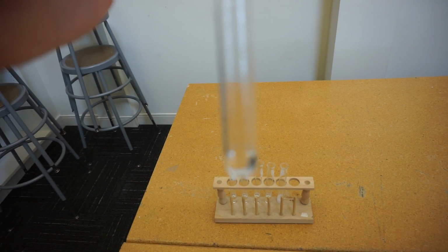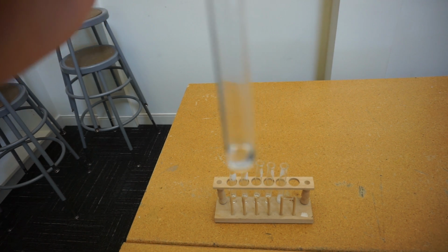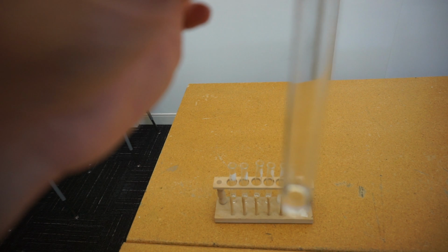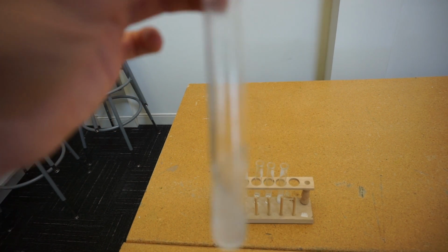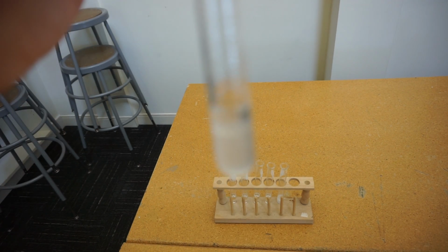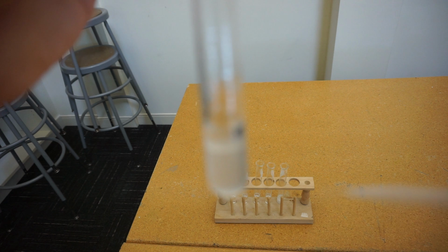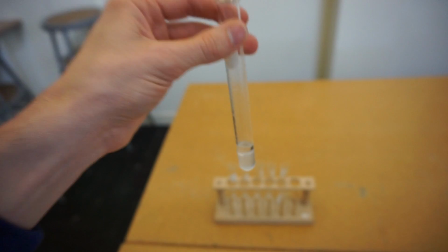And our final one is octanol, and again, if you think about the chain lengths, we might start to think about how quickly or how slowly any interface might appear, and with this one we can see almost immediately we're getting this interface. We're getting two different liquids and they're just not mixing at all.